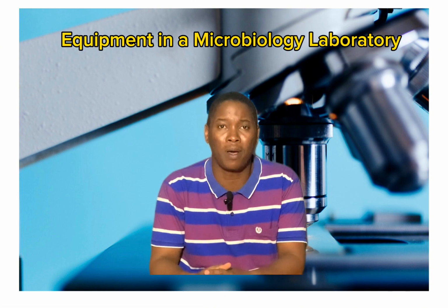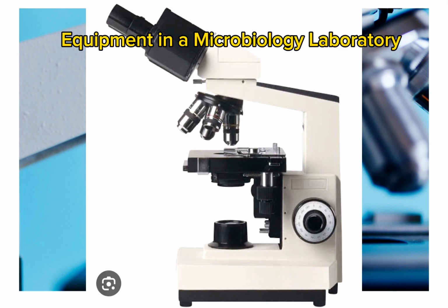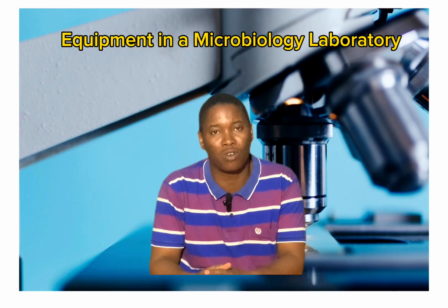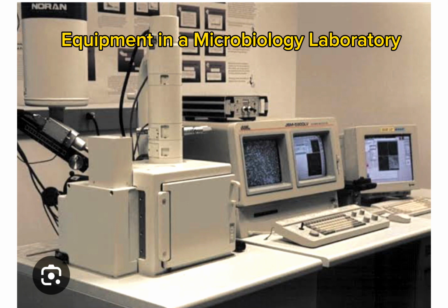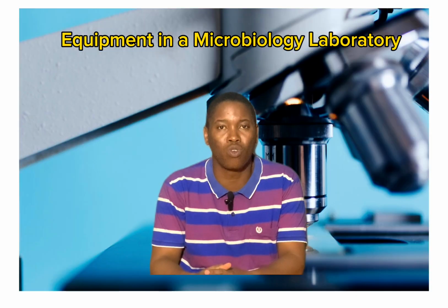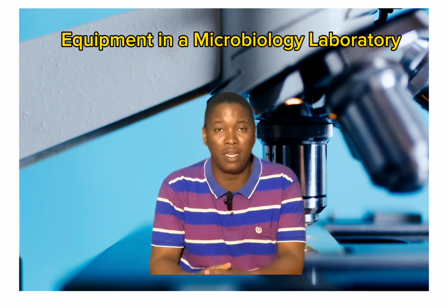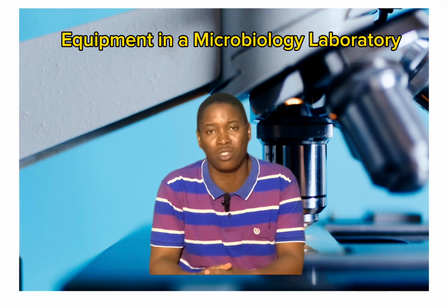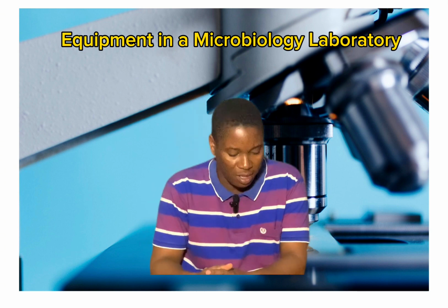You have the compound light microscope, the transmission electron microscope, and the scanning electron microscope. The important thing that they do is that they produce large images of microscopic organisms, so that these images can help scientists to better study these organisms and the structures and the functions of different structures within these organisms.